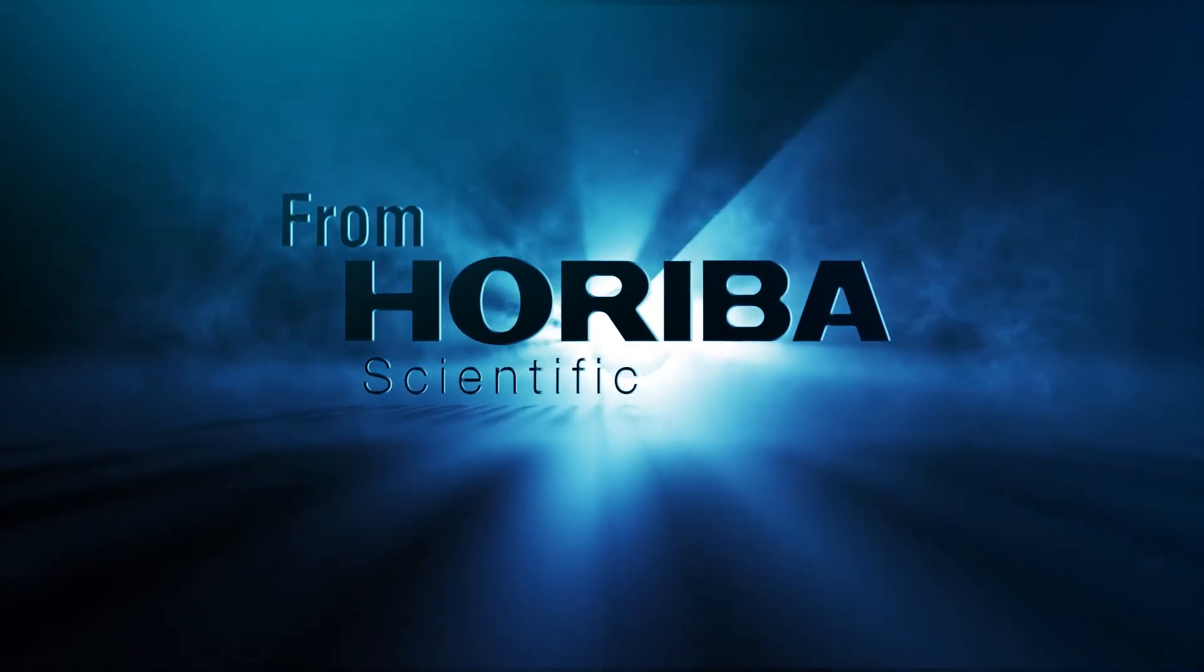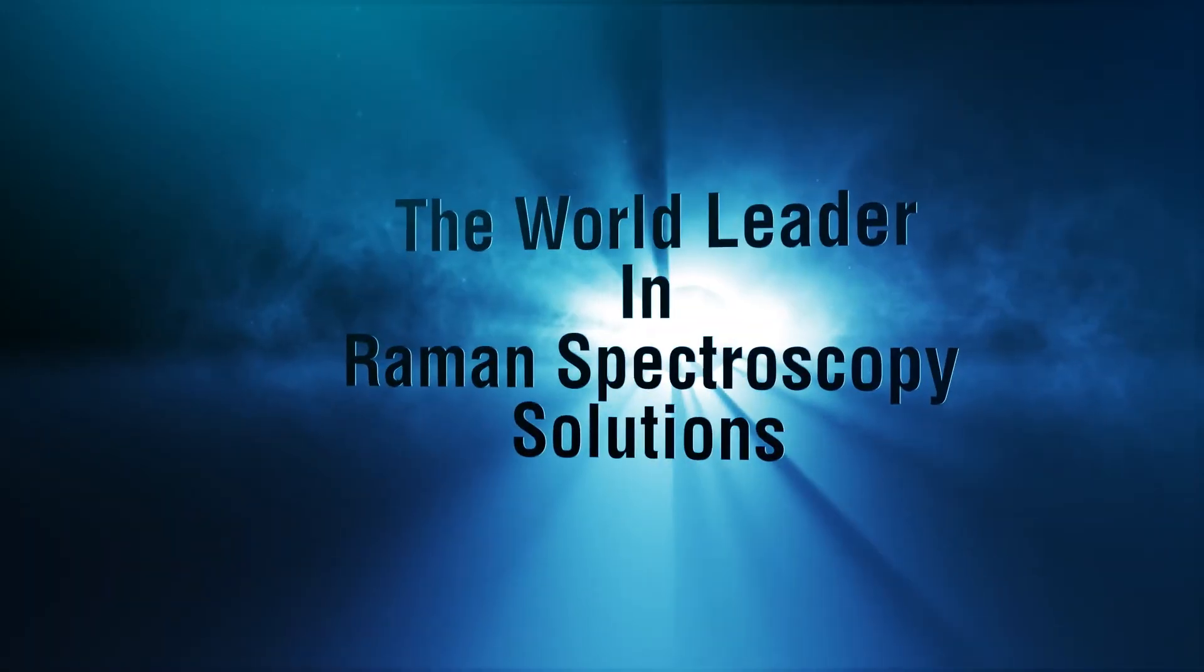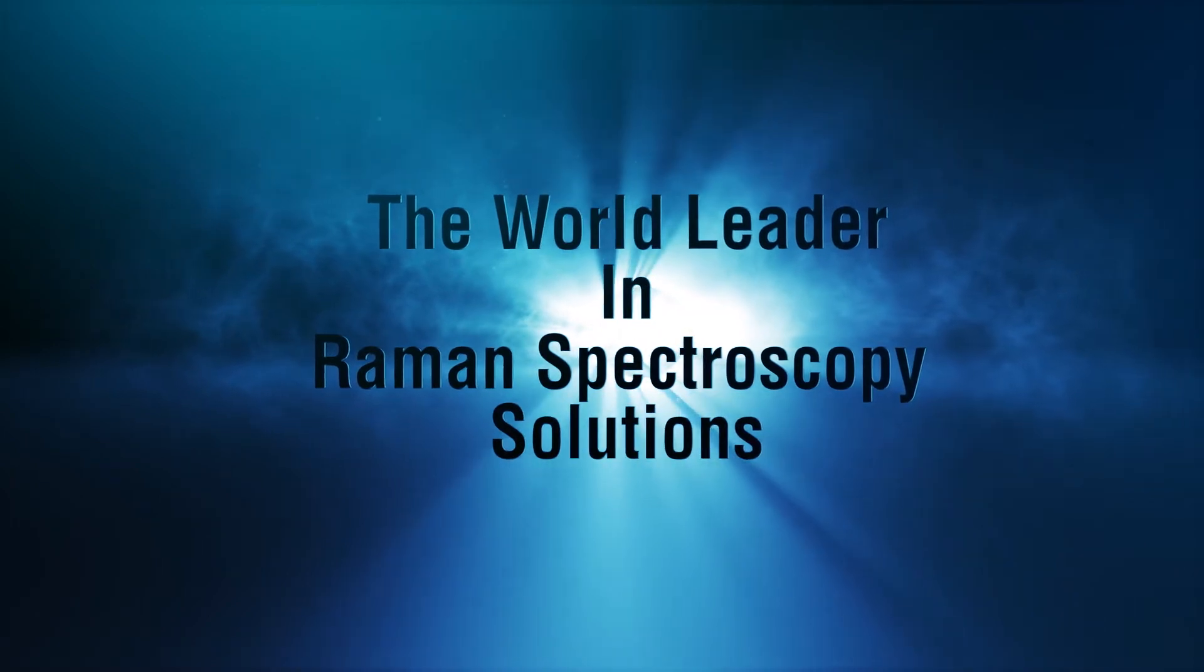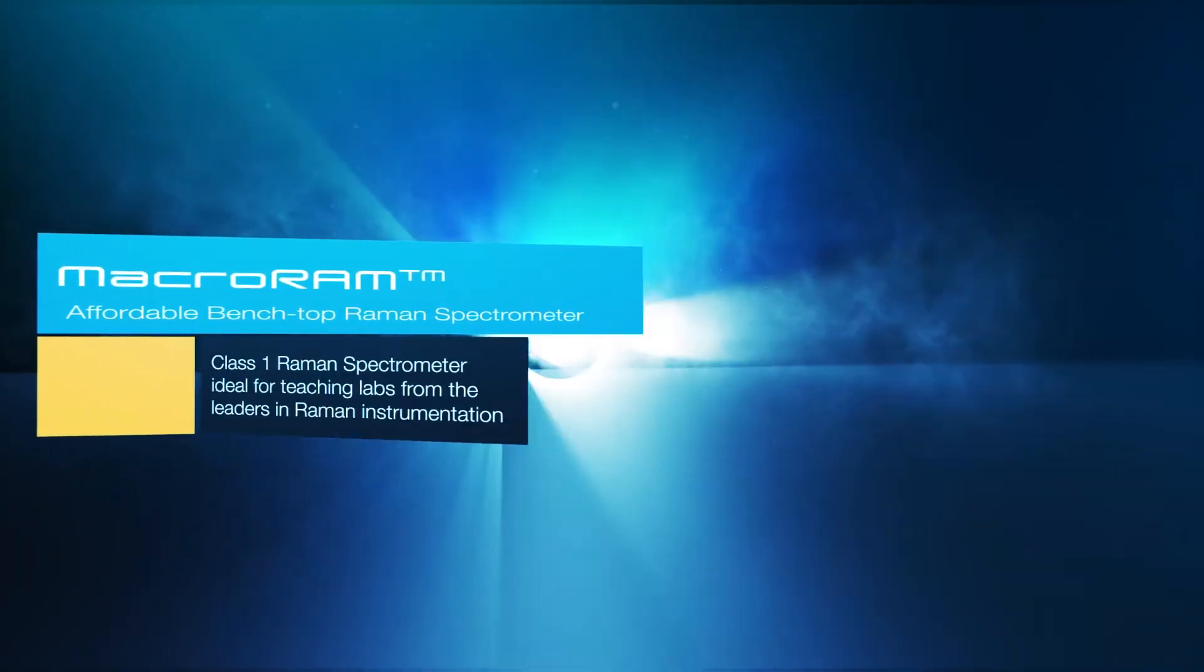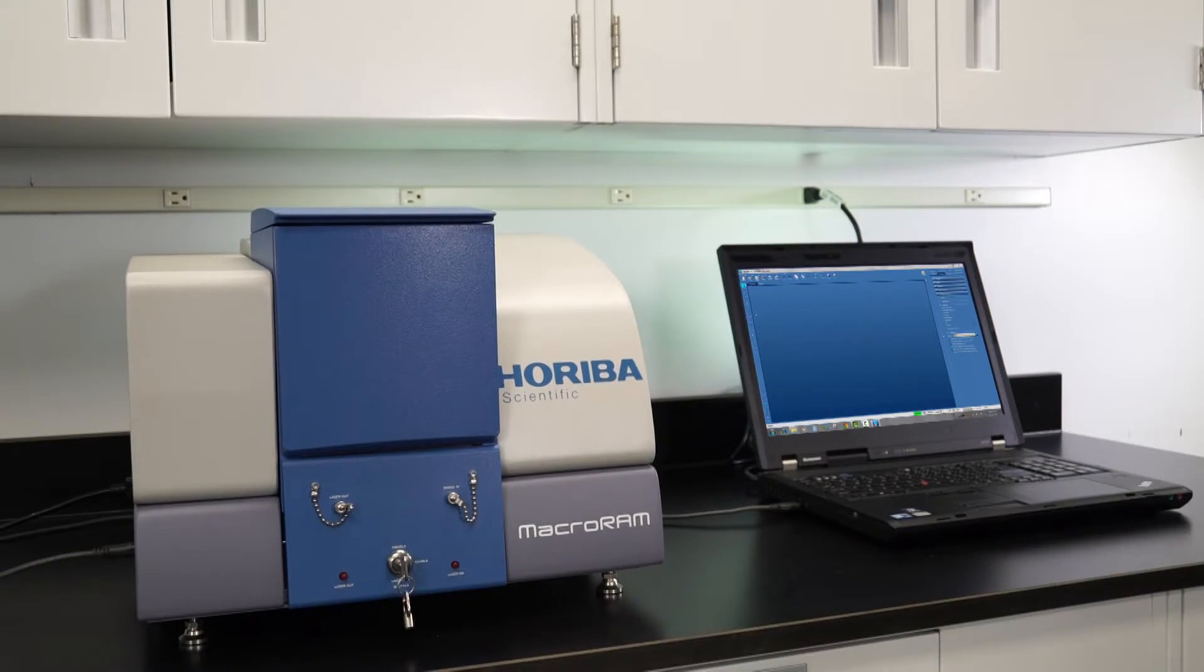From Horiba Scientific, the world leader in Raman spectroscopy solutions, the affordable MacroRAM, a compact and easy-to-use plug-and-play device.